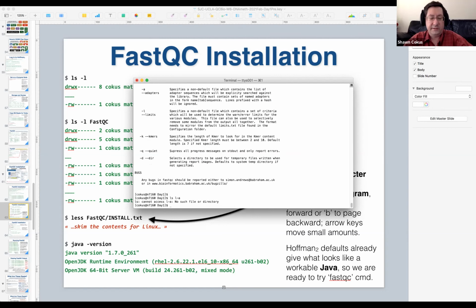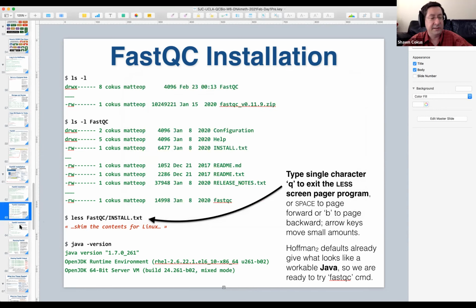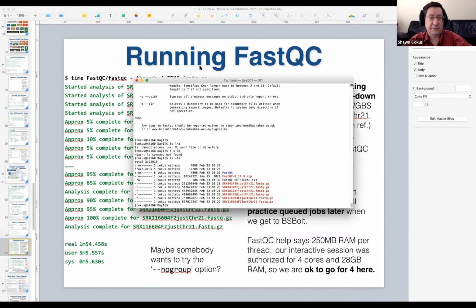And so all we need to do is start feeding it some of these files, and we can actually feed it all of them at once, and it runs in parallel, I think. So let's see here. Let's scroll. All right, we just did this slide, and then we're kind of on this side. We're actually going to run this thing.